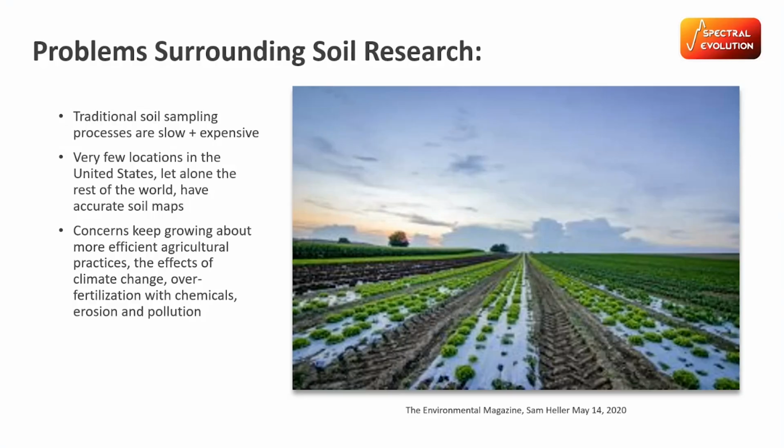So that's where spectrometers would come in as a field-based instrument. They allow us to rapidly and accurately measure soil properties right in the field, helping build better soil databases, monitor changes over time, and guide smarter land management decisions and more targeted harvest dates for precision agriculture.